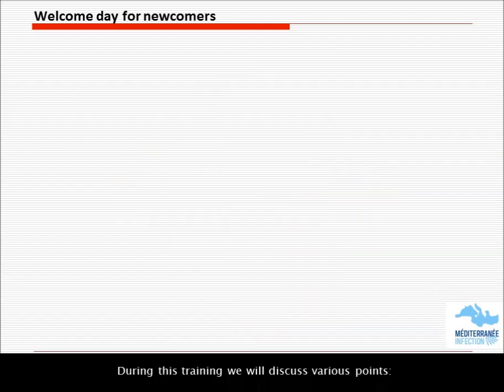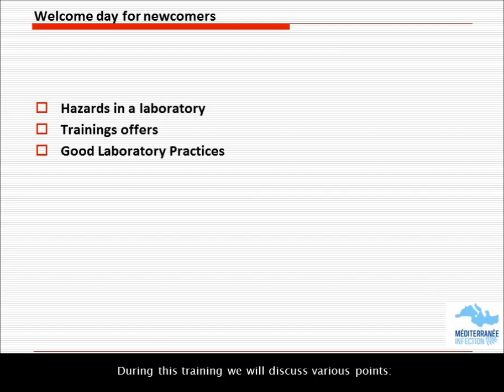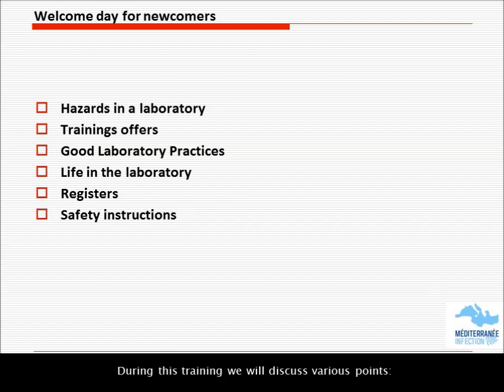During this training we will discuss various points. Hazards in the laboratory. Training offers available at the Institut Hospitalo Universitaire. The laboratory practices. Life in the laboratory and some rules of its operation. The registers at your disposal. Safety instructions. And we will finish with the validation questionnaire of this training.